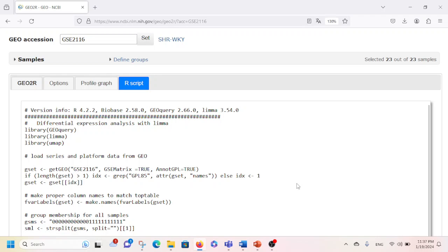I hope in this video I was able to show how to perform gene expression profiling online using the GEO2R tool. Thank you.